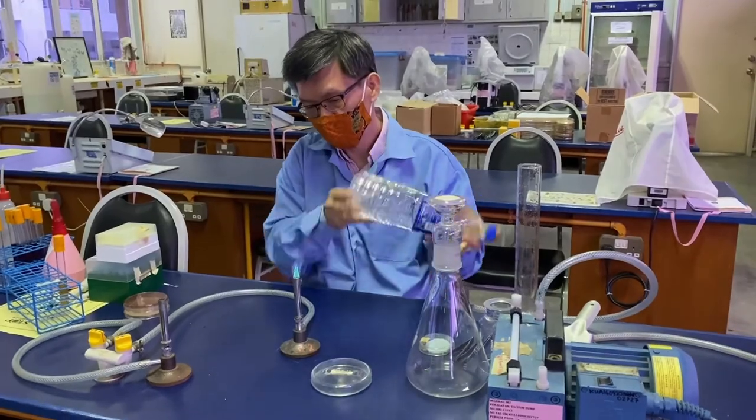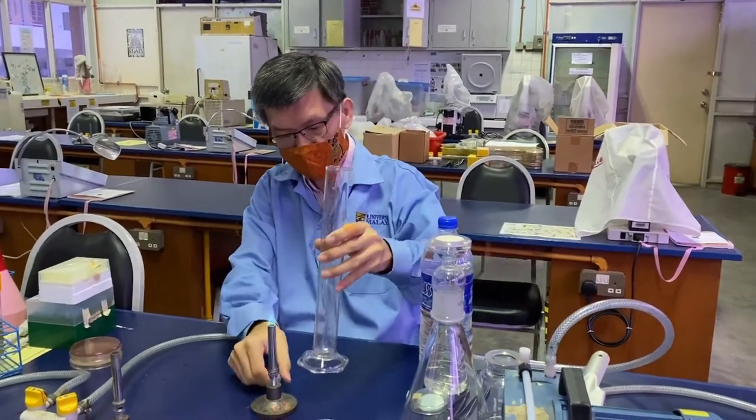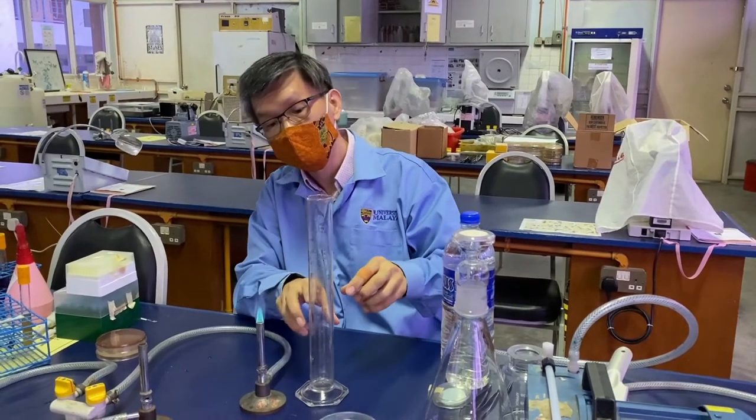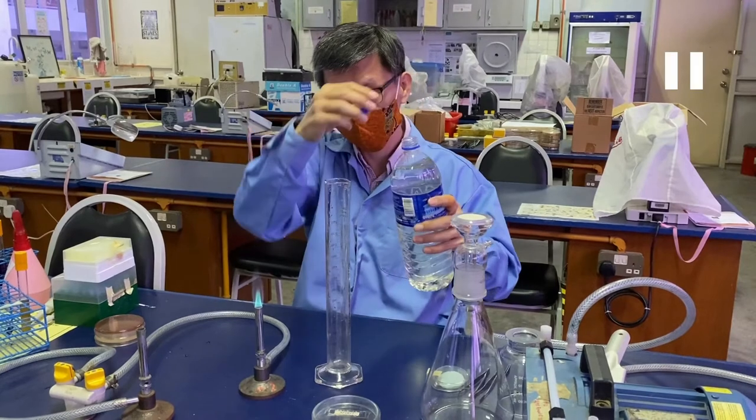Next we will measure the volume of sample to be filtered. Mix the sample well and measure using a measuring cylinder. The measuring cylinder should be autoclaved first, by autoclaving it with aluminum foil wrapped around the mouth of the measuring cylinder.